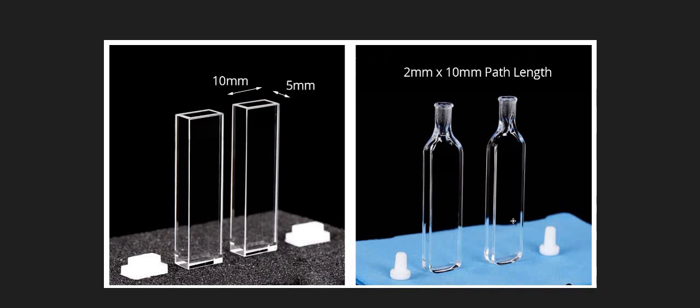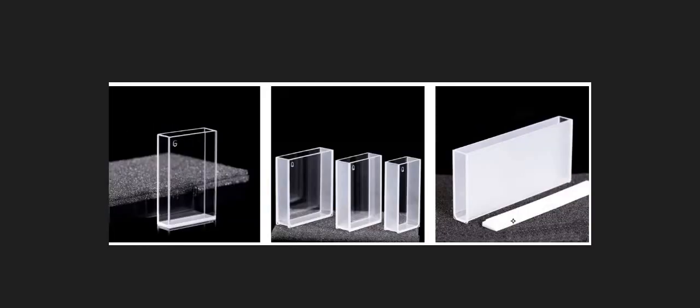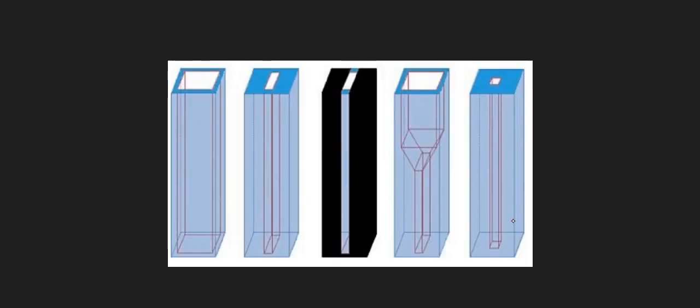So we have seen the variety of cells which are normally used in spectrophotometers and their dimensions.